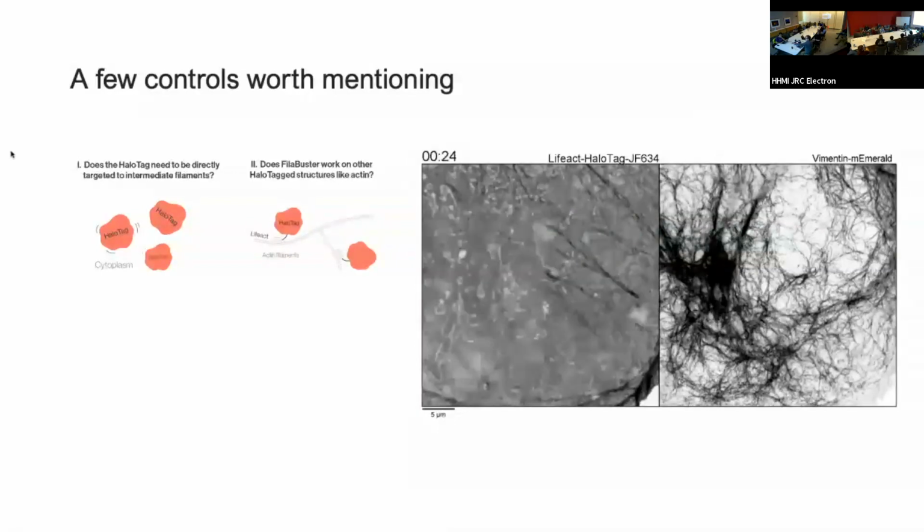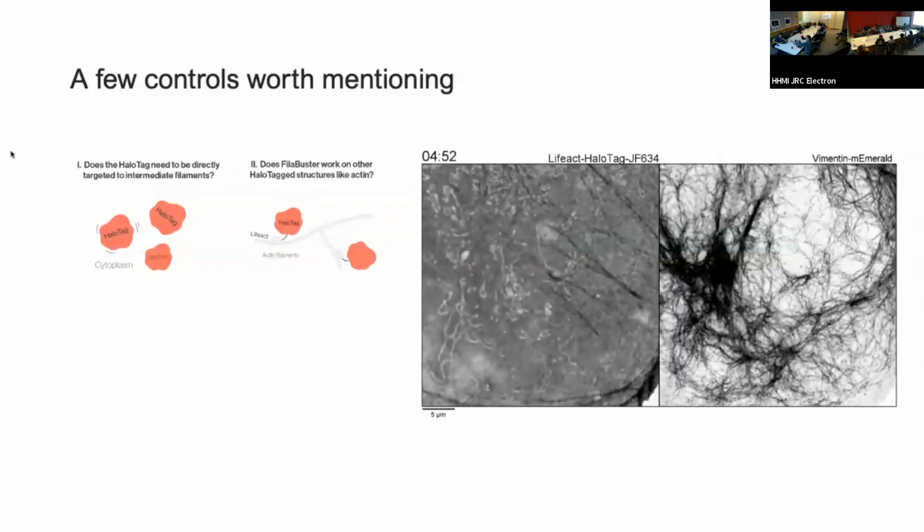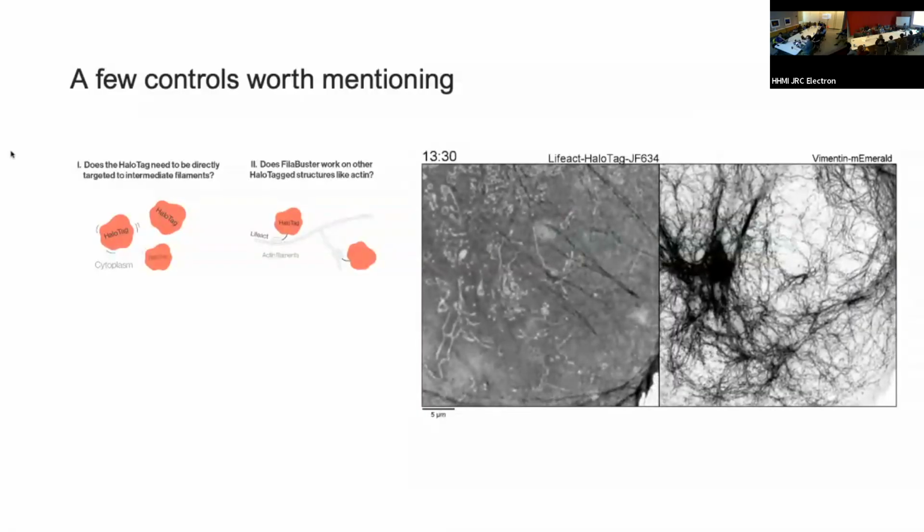But I'll play it one more time. If you just look at the mitochondria in the negative that you can kind of see, you'll see they begin to sort of swell and pop as the movie goes on. The cell is going to die not long after this. And the light dose used here was, I think, something like 20% laser power on the far red. We have the actual measurements accompanying it, but suffice to say, much higher than you want to use.